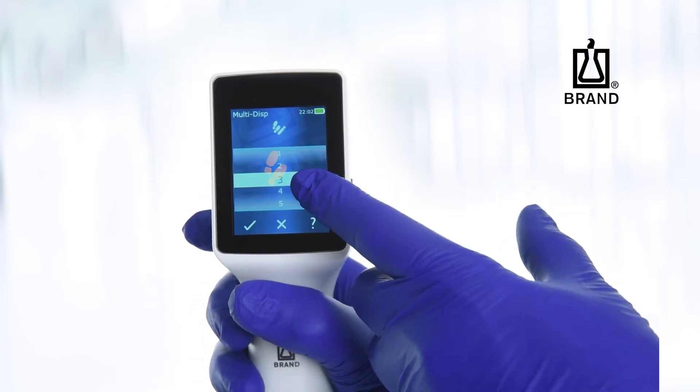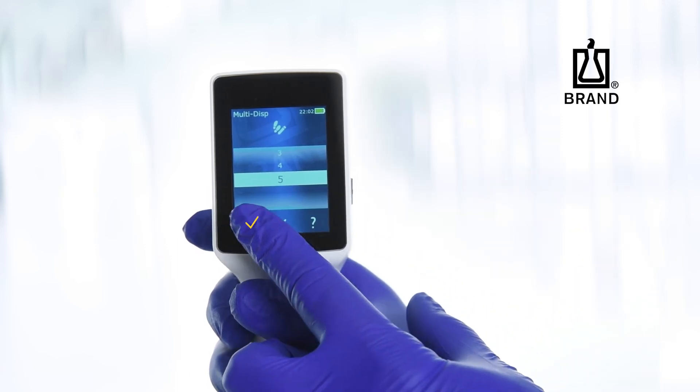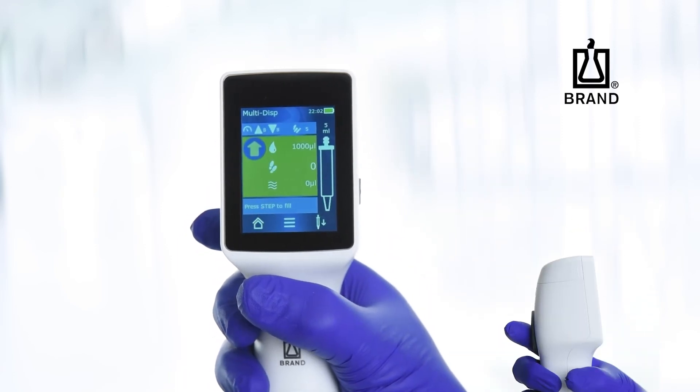Set the number of dispensing steps by swiping vertically. Tap to confirm. Press the step key to aspirate.